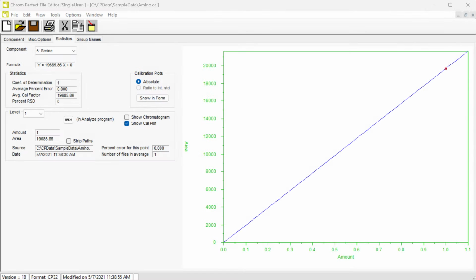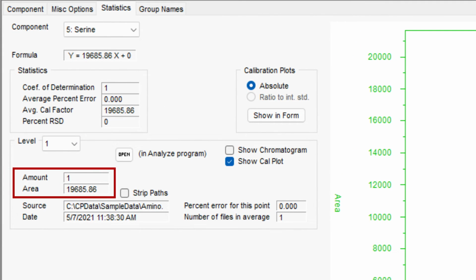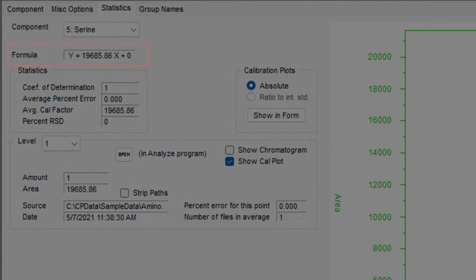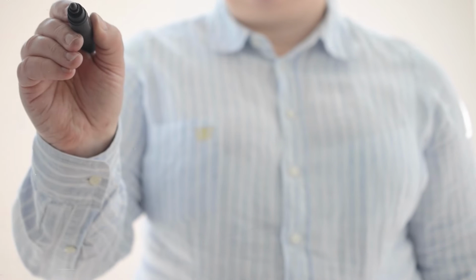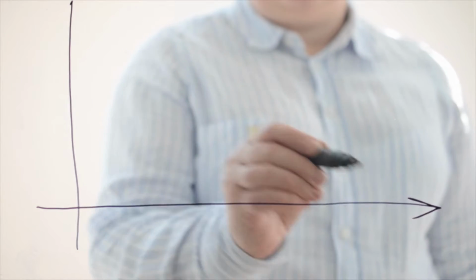Calibration curves are created by fitting a selected kind of curve to a set of data points. Each data point has two values, an amount and a response. By fitting the calibration curve to these points, we obtain a formula, the formula of the calibration curve. This formula gives the response as a function of the amount, and hopefully will accurately predict the detector response for intermediate amounts. Readers are forewarned that this chapter contains more mathematics than any other, and mathematical terms are frequent throughout.